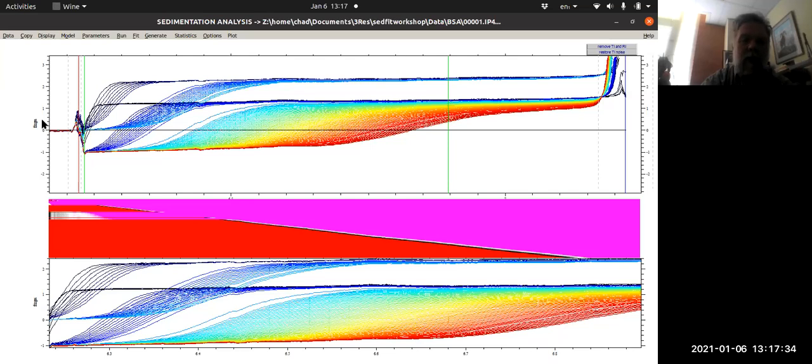So if you remember, I talked about constructive and deconstructive interference for the interferometer. If the algorithm that turns the fringe position into this y-axis value, which is in your data file, guesses that your fringe starts at 0 and then it comes along to a different set of data and guesses that the fringe starts at a different value, it will have what's called jitter. And the jitter is usually quantized by values of individual fringes, 1 or 2 or 3. So you can see that the maximum of this data set seems to be about 1, and the maximum of these seems to be about 2. That will get corrected for in the fit.